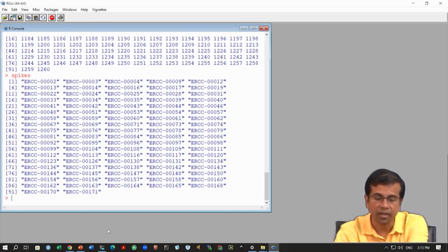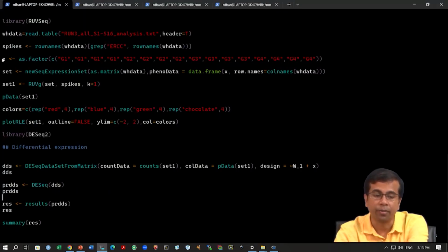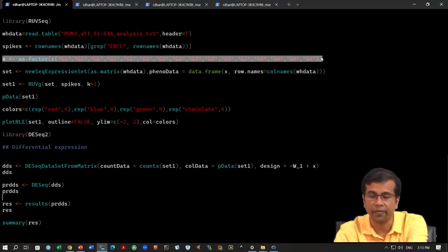All right. So, once we have now defined the spikes, what we are going to do is set up something called factors.